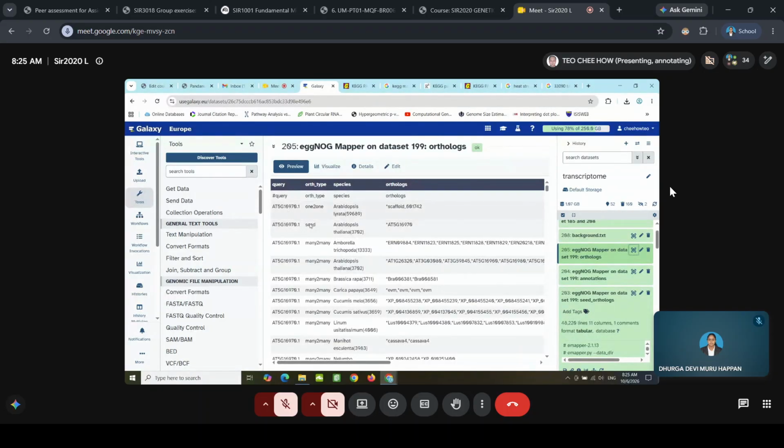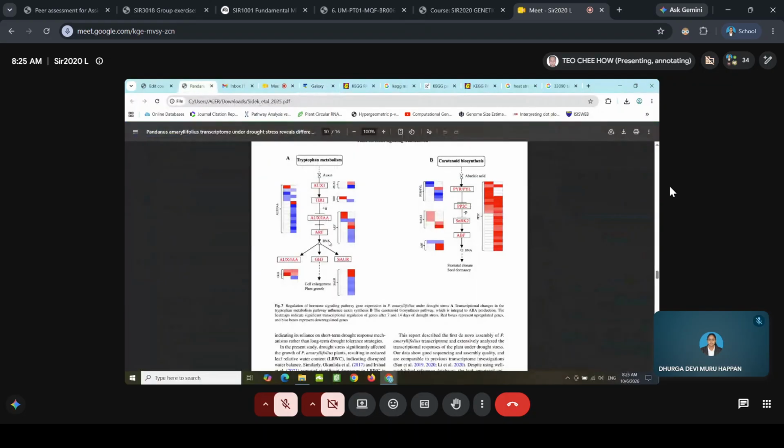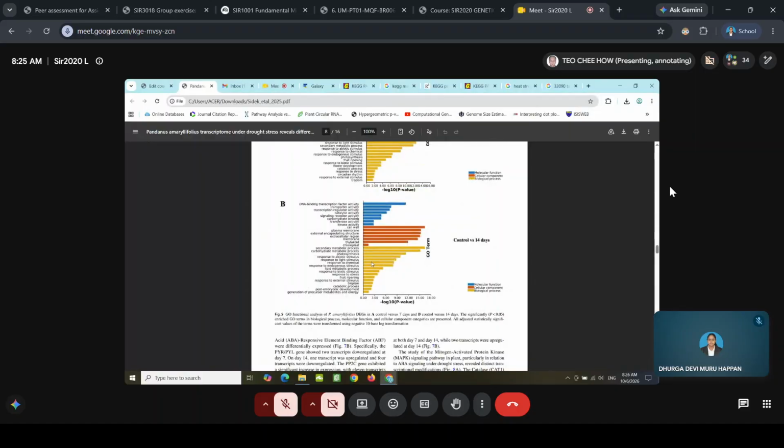For example, for these genes, right? So what is the ortholog name? Both are orthologs. So in Arabidopsis thaliana, basically more important is this one, because later you can use it in TBtools to draw the analysis, to draw this kind of plot in TBtools.